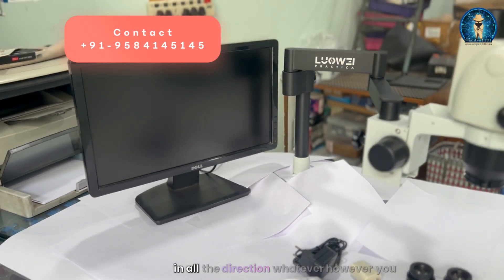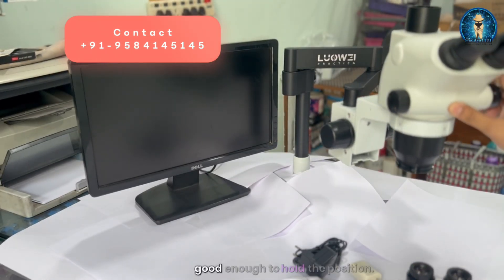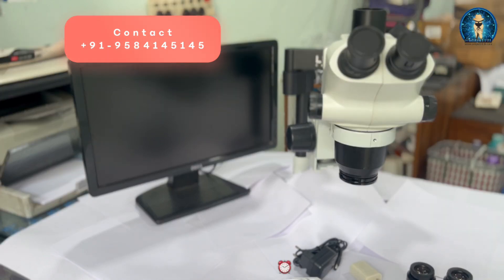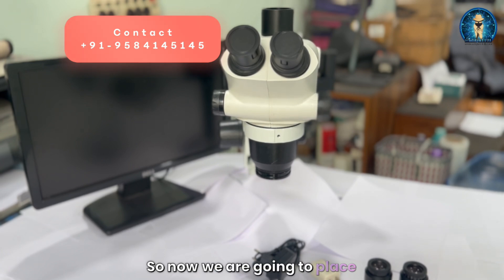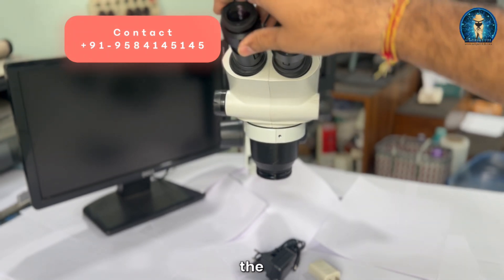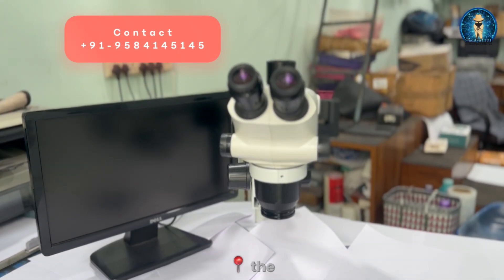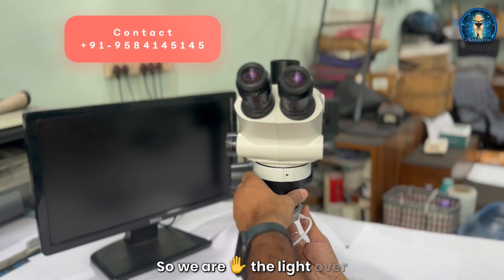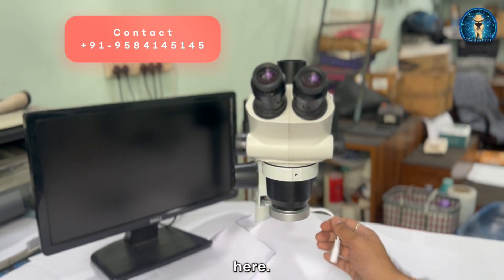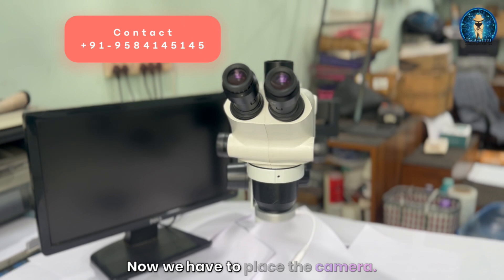The stand is easily movable in all directions however you want — the only thing is your base should be good enough to hold the position. Now we will put the camera and light and show you a demonstration. We are placing the eyepiece because this is a trinocular and you will need an eyepiece to view the object. Next, we are placing the light, which is very important for viewing the object clearly.